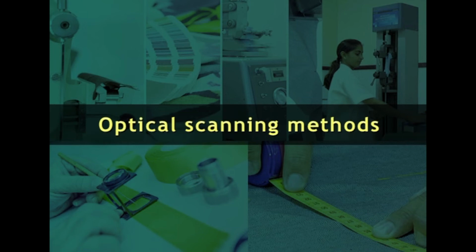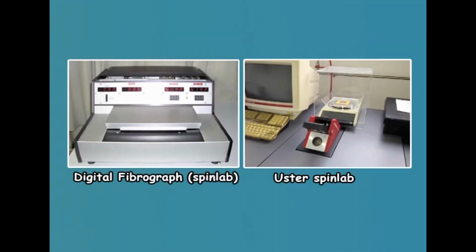Now let us look at optical scanning methods. This is the most widely used method of fiber length measurement. Some of the instruments are the Digital Fibrograph from Spinlab, the Uster high volume instrument, etc. The main advantage of this method is that it is much faster than the other methods, not influenced by personal judgment, and this method can be linked with other testing such as strength testing also.